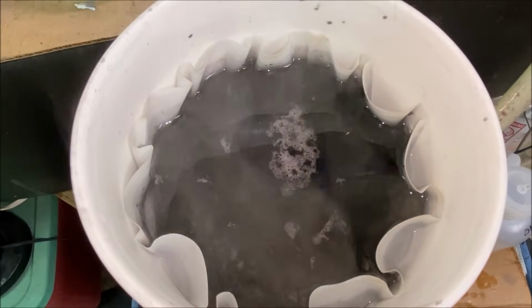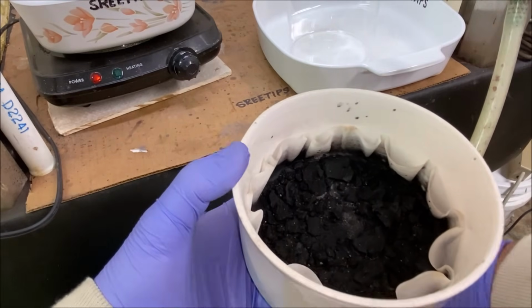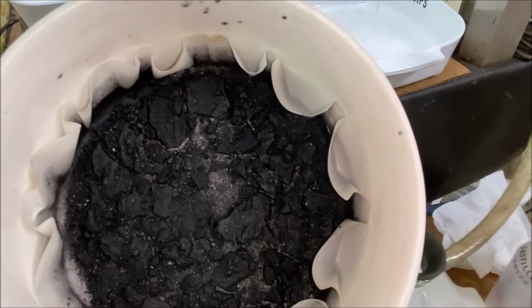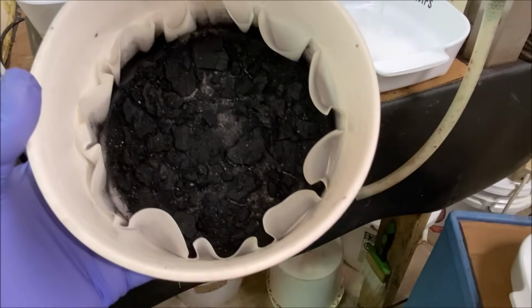Let's go ahead and get our solids out of here. What we'll do is transfer these into a clean beaker.